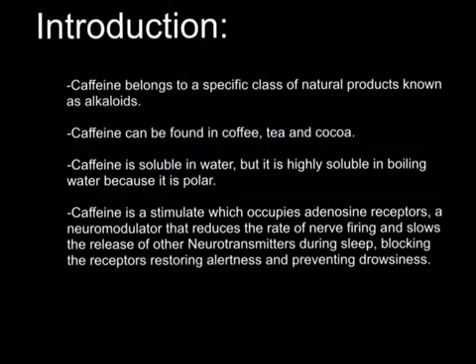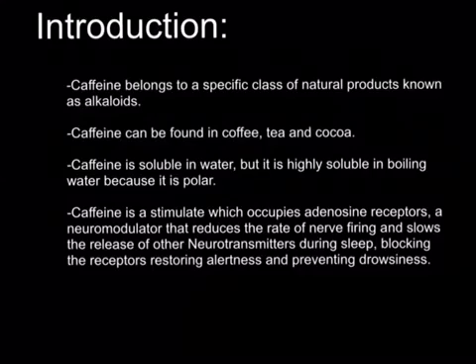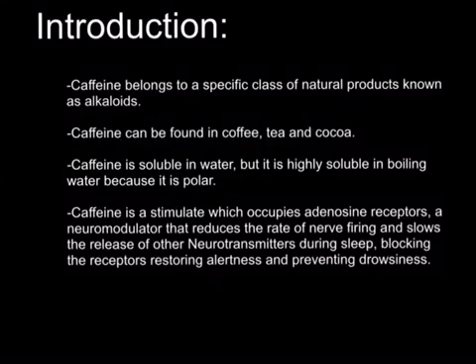Introduction. Caffeine belongs to a specific class of natural products known as alkaloids. Also, caffeine can be found in coffee, tea, and cocoa. Caffeine is soluble in water, but it is highly soluble in boiling water because it is polar.